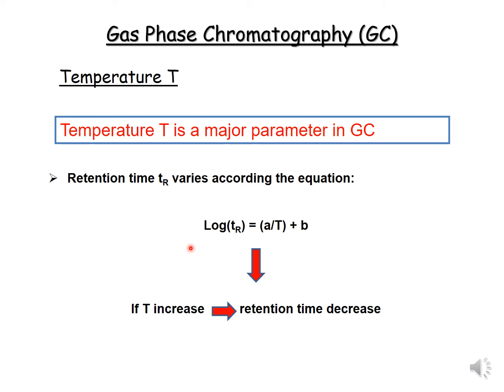This is a very important parameter to optimize the separation, especially to optimize the analysis time. So if the temperature increases, the retention time decreases.